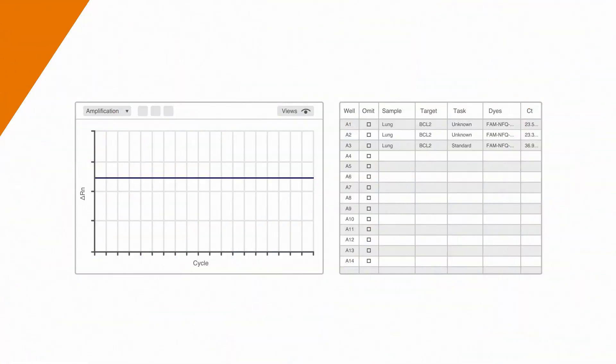Let's look at an example to see why. Here's a set of replicates for our target. The CT values are 20, 19, and 37. Hmm, looks like maybe I forgot to add sample to this well.